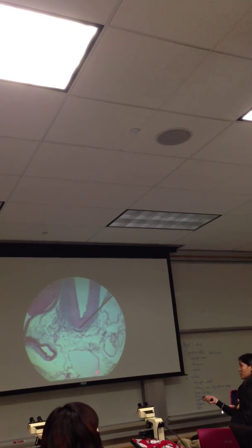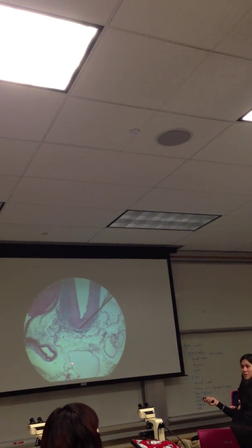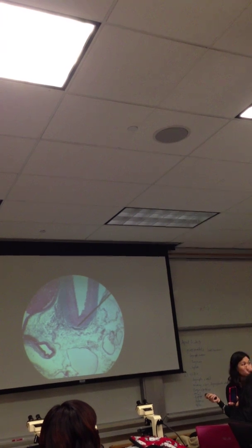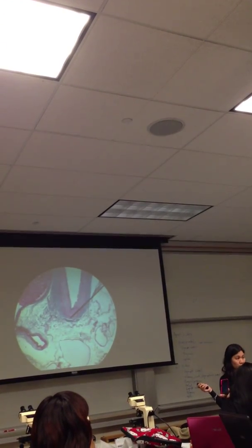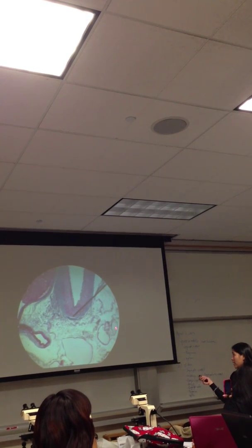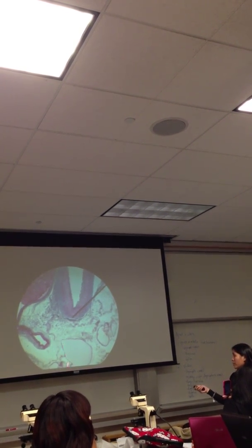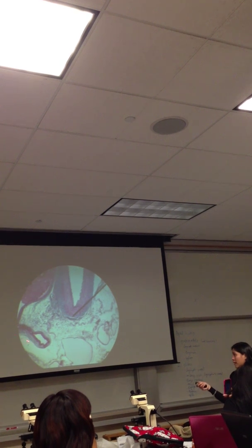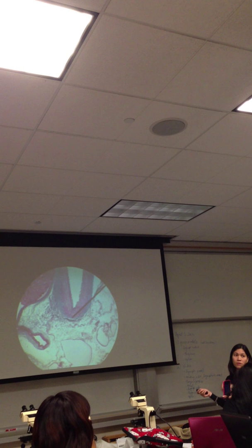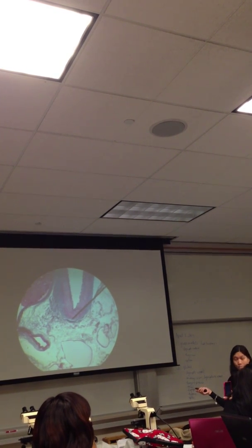Do you see the difference in the wall, right? It's very thin. I promise you it wasn't going to be green, but at least the structure is very similar to the one in your book, right? It's a very thin one, and it's also irregularly shaped, just like your veins, but your veins will be much thicker, right?